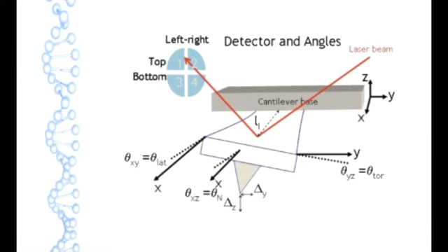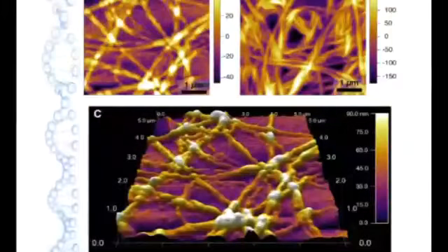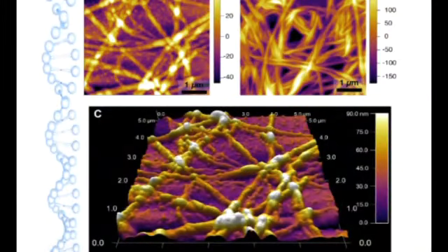This is an example of a surface. The pointer measured the topographic map. We can also scale them to different characteristics. This image is color-coded to relay the height of the material of a sample size of 1 micron to 100 nanometers. We can see how different characteristics come together to give us a great picture of the characteristics embedded in the material. These scans took place from different directions to cross-reference the data to ensure accuracy.